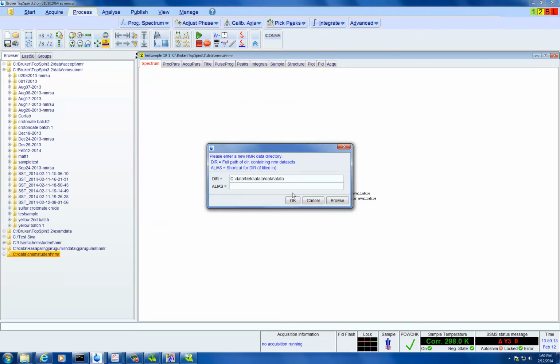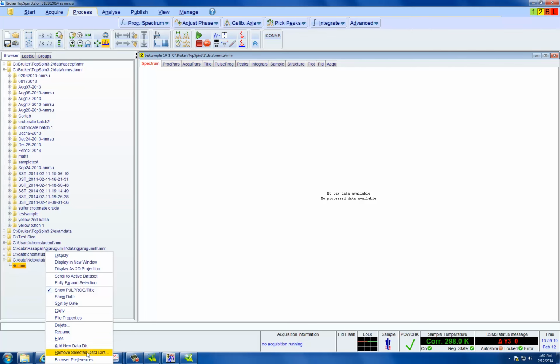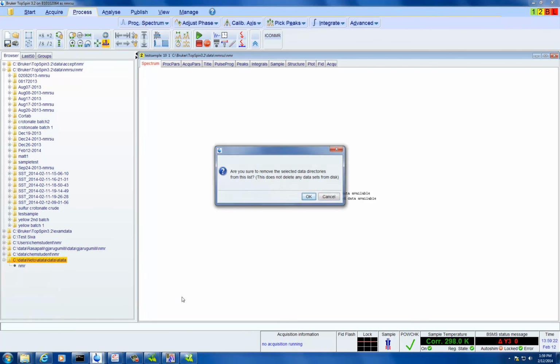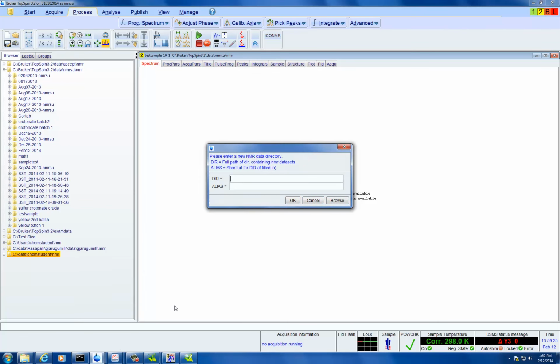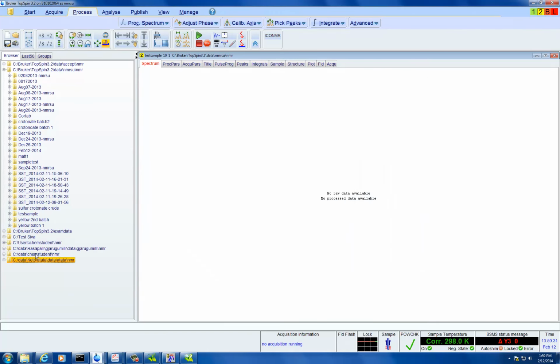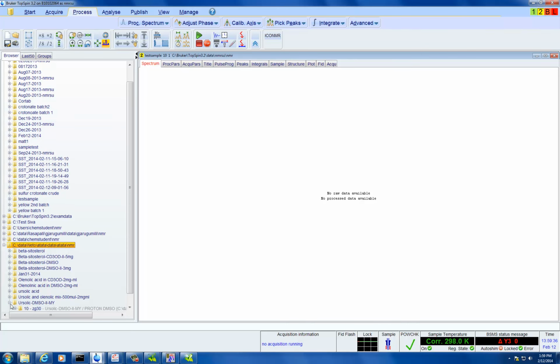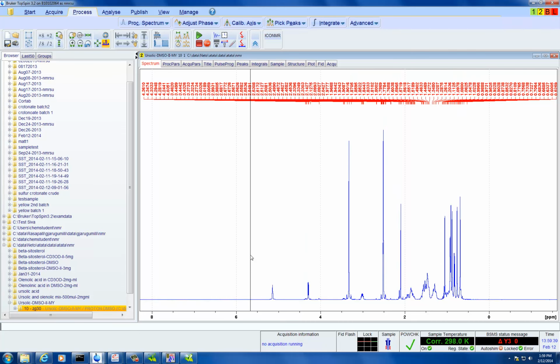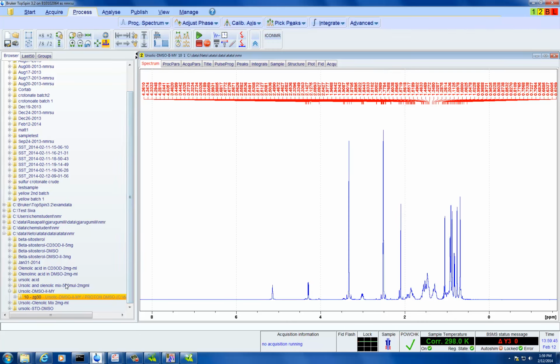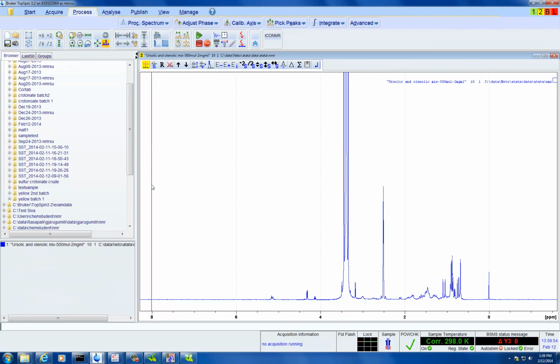I'm just going to see if I can load up. So these are your compounds. Which ones? Not this one. The combination of the ursolic and oleanolic. Ah, this one. Okay.